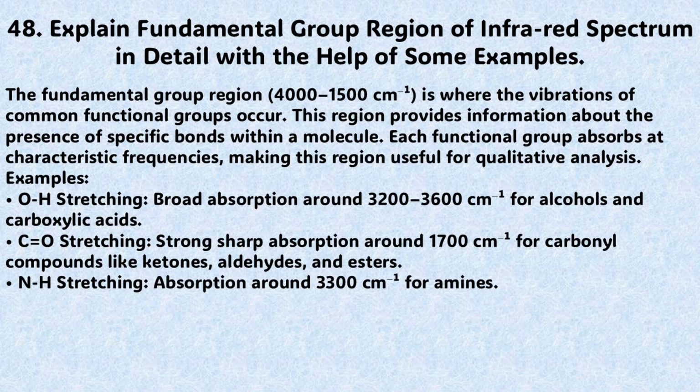Examples: O-H stretching, broad absorption around 3200 cm⁻¹ to 3600 cm⁻¹ for alcohols and carboxylic acids. C=O stretching, strong sharp absorption around 1700 cm⁻¹ for carbonyl compounds like ketones, aldehydes, and esters. N-H stretching, absorption around 3300 cm⁻¹ for amines.